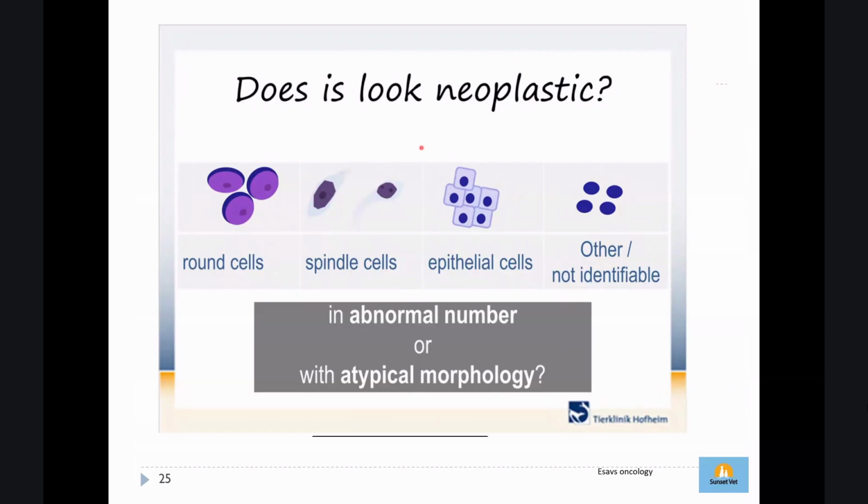Like that one. And then, okay, let's say I don't think it's typically inflammation though. So is it neoplastic? So let's see. For the neoplastic, the things that you have to remember: there is round cell, there is spindle, and then there is epithel.